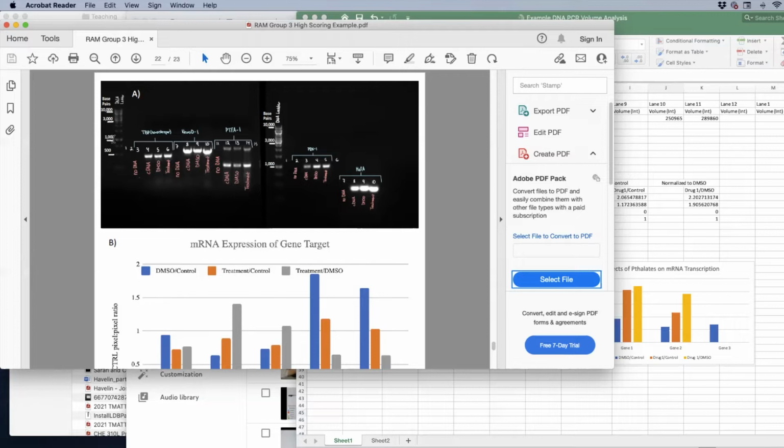Over here on the left, just like you guys are going to see, is your DNA ladder. You can use the vendor information image that I uploaded to each section's Brightspace page, and you're going to want to highlight what size each of these DNA ladder chunks are. I think I mentioned this in all sections. This really faint one down here is 250, and they've labeled it 500. The first bright one is 1000, and they've labeled it as 1000. This will make it a lot easier to scroll across and estimate the size of your bands.